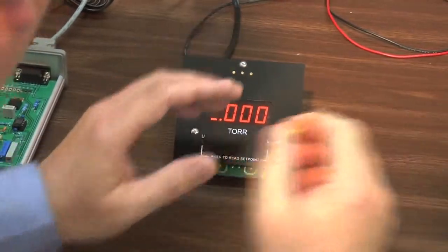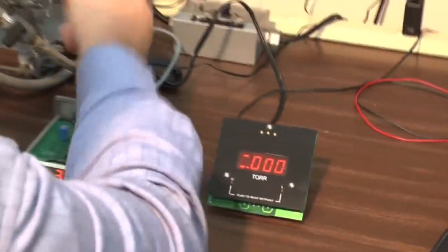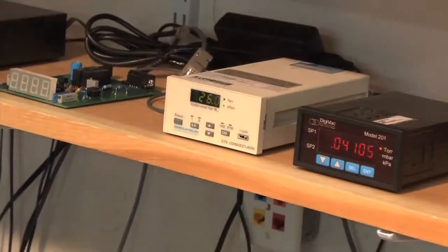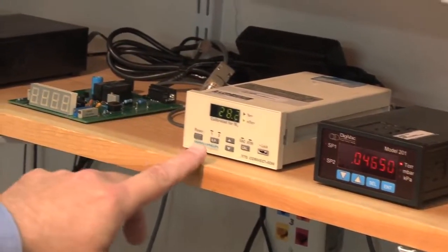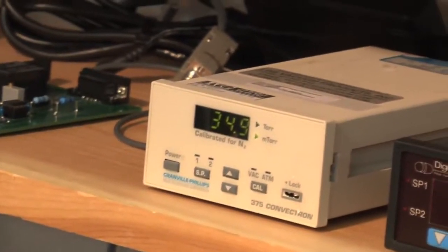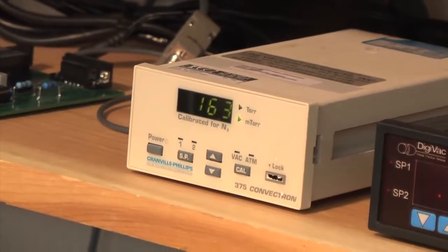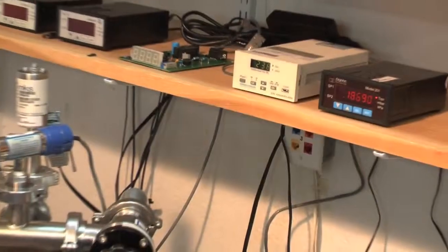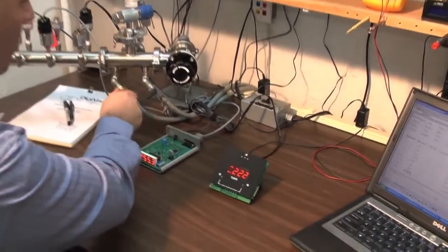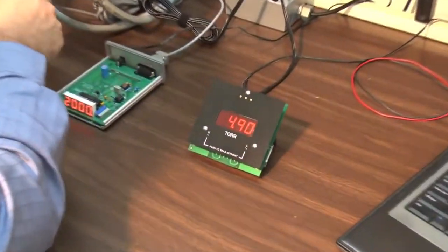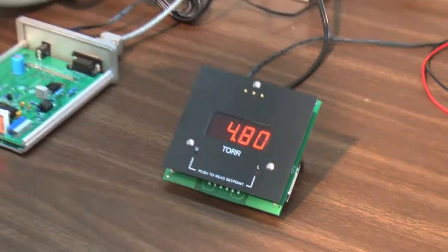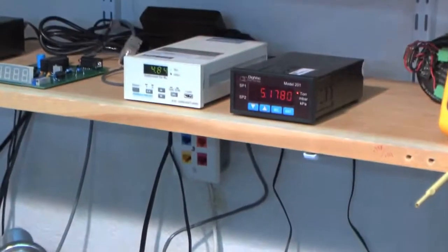If the reading is stabilized, we can stop our vacuum system and observe readings on the way up back up to atmosphere. Our convectron indicates approximately 30 mil torr, 29. We can introduce more dry nitrogen. 238 mil torr, 217 on the 801W, an acceptable reading. We'll look at some higher readings. 4.84 on our convectron, 4.80 on 81W.